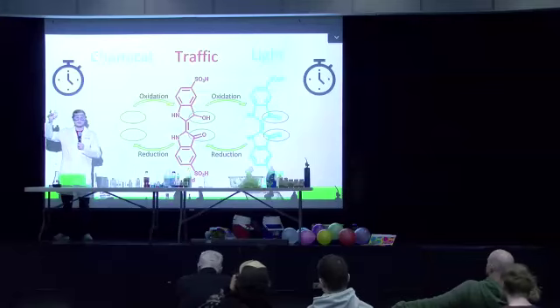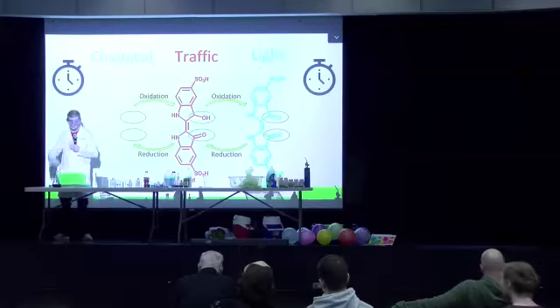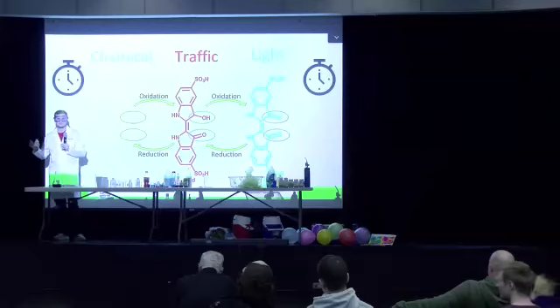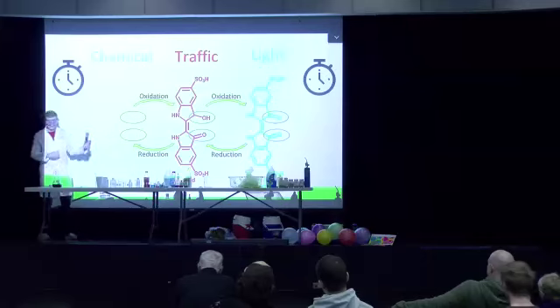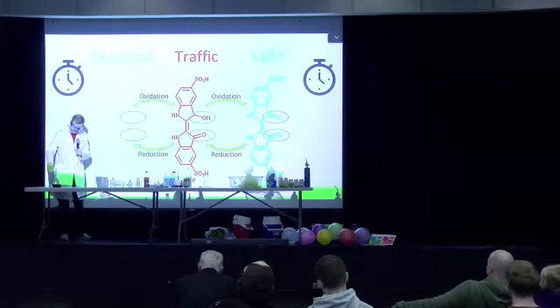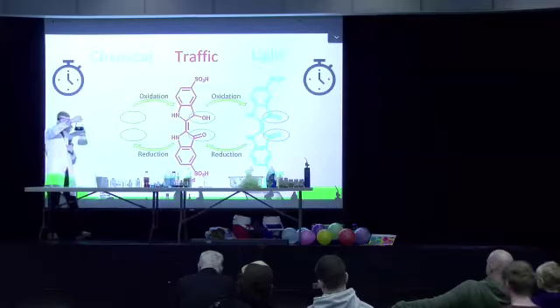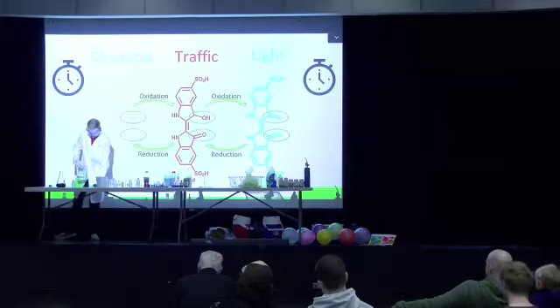And then in here, I got some sodium hydroxide. So what do you guys think will happen when I add the sodium hydroxide? Anyone? I'll give you a hint. All right, so I add the sodium hydroxide, which is still a little dark for you guys. Are you guys able to see the color? Or I'll add a little water to dilute it down.